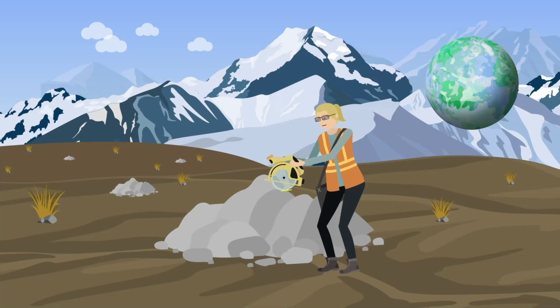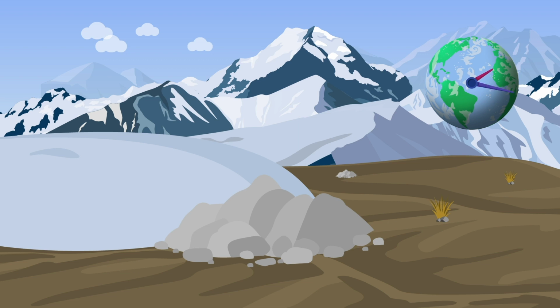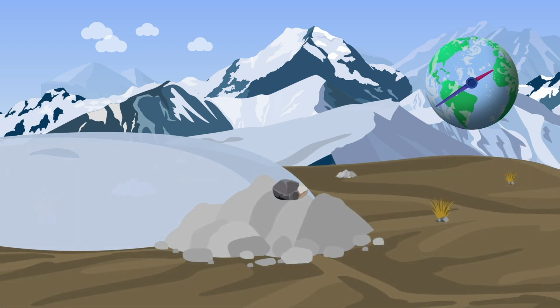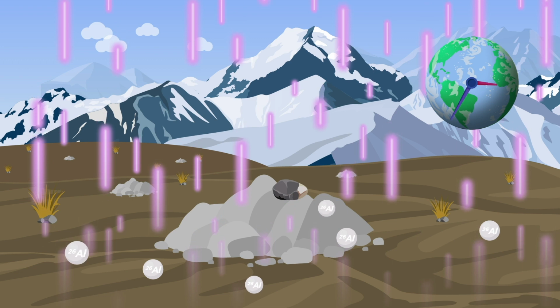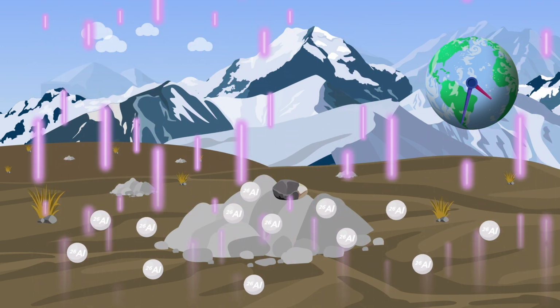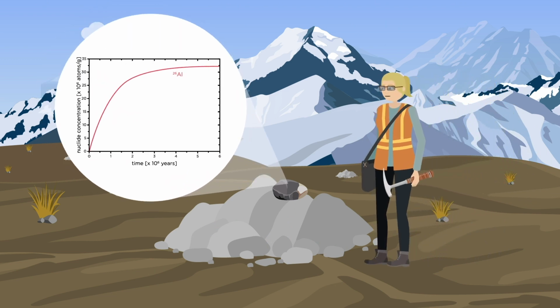If a rock sample is collected from beneath a glacier, or a boulder that's left behind from a melting one, it acts as a time capsule for the environmental conditions in a warmer world. This rock has been exposed to cosmic rays since the glacier retreated, so aluminium-26 is produced year by year since then. AMS can measure the radionuclide concentrations, hence telling scientists when the boulder emerged from the ice.